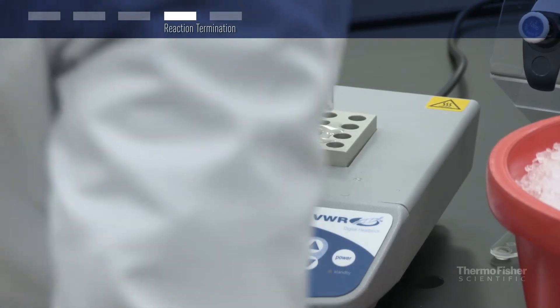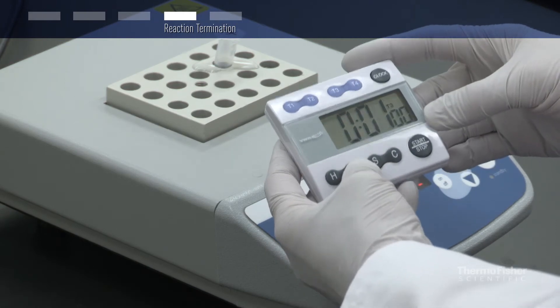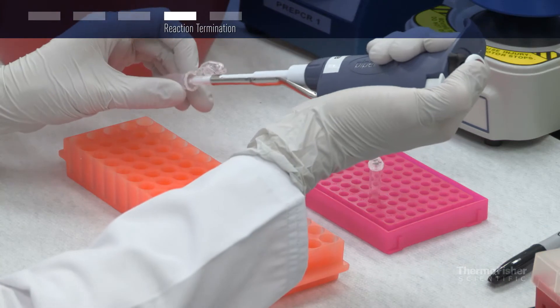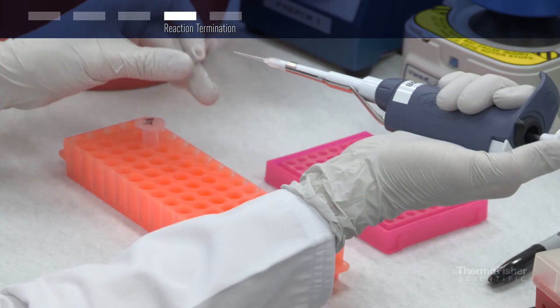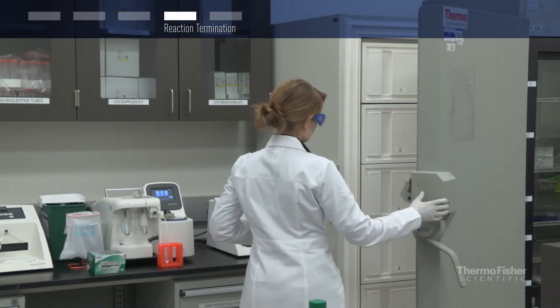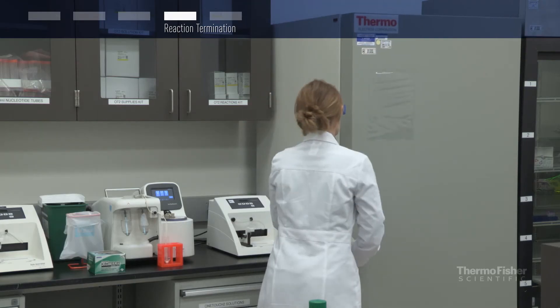To terminate the cDNA synthesis reaction, incubate the mixture for five minutes at 85 degrees Celsius. Use the cDNA immediately for downstream applications such as PCR or qPCR, or store it at minus 20 degrees Celsius for up to one week, or minus 80 degrees Celsius for longer-term storage.